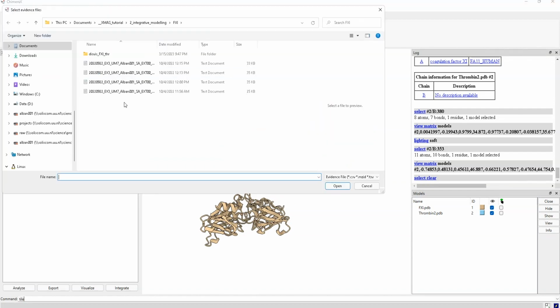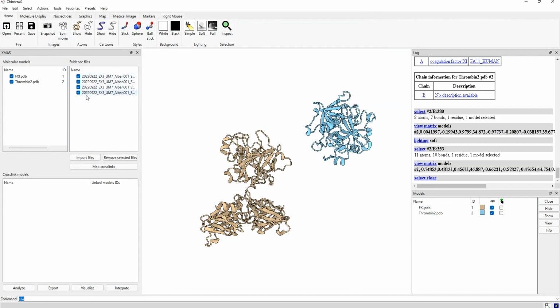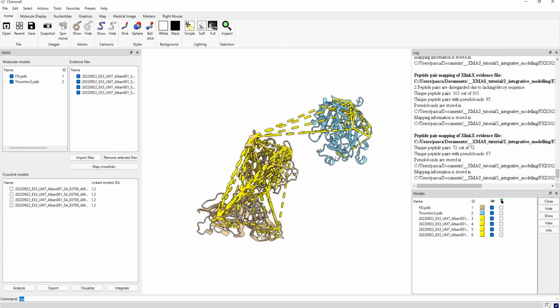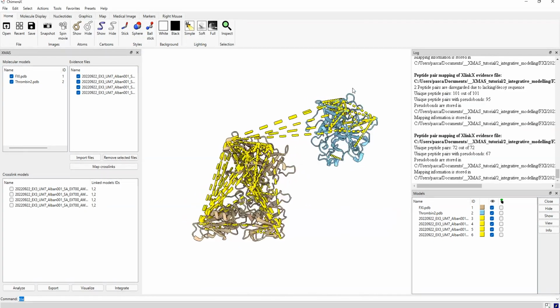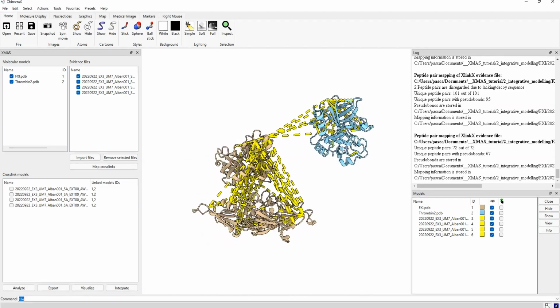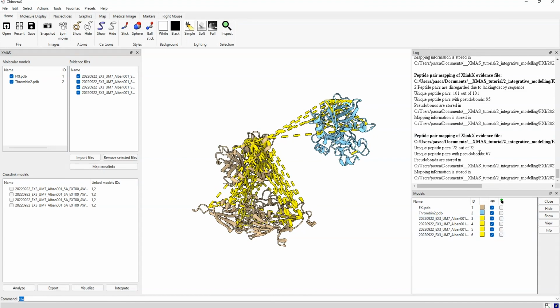So we can map crosslinks on this. For this, we have, for example, 4 different replicates that we can open here, and we just hit the button, map crosslinks, and we're interested in the interlinks between thrombin and factor 11, so in their interaction sites. So we redo all the pipeline again. We only look at interlinks for now. You will see that many conformational changes can come.